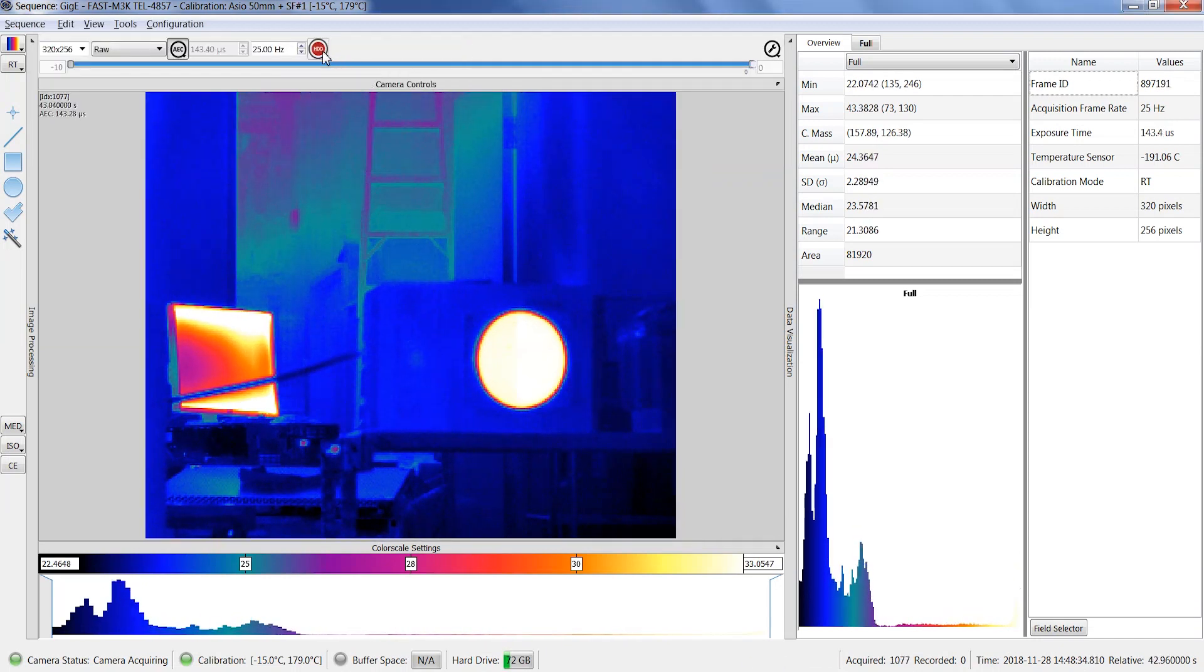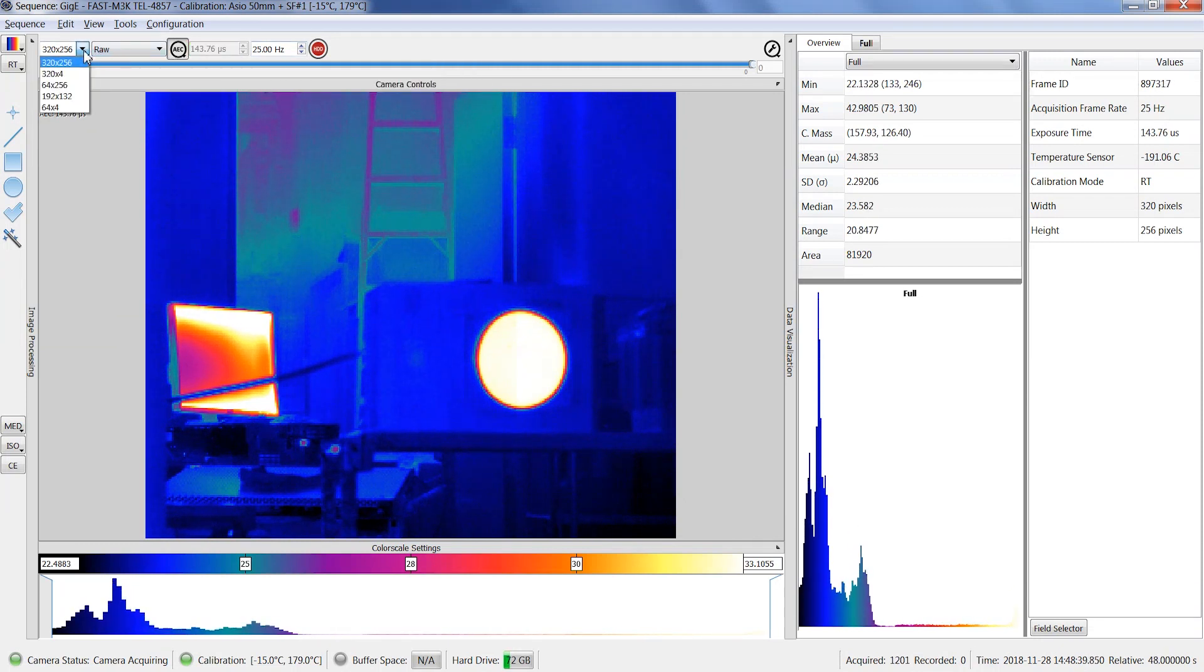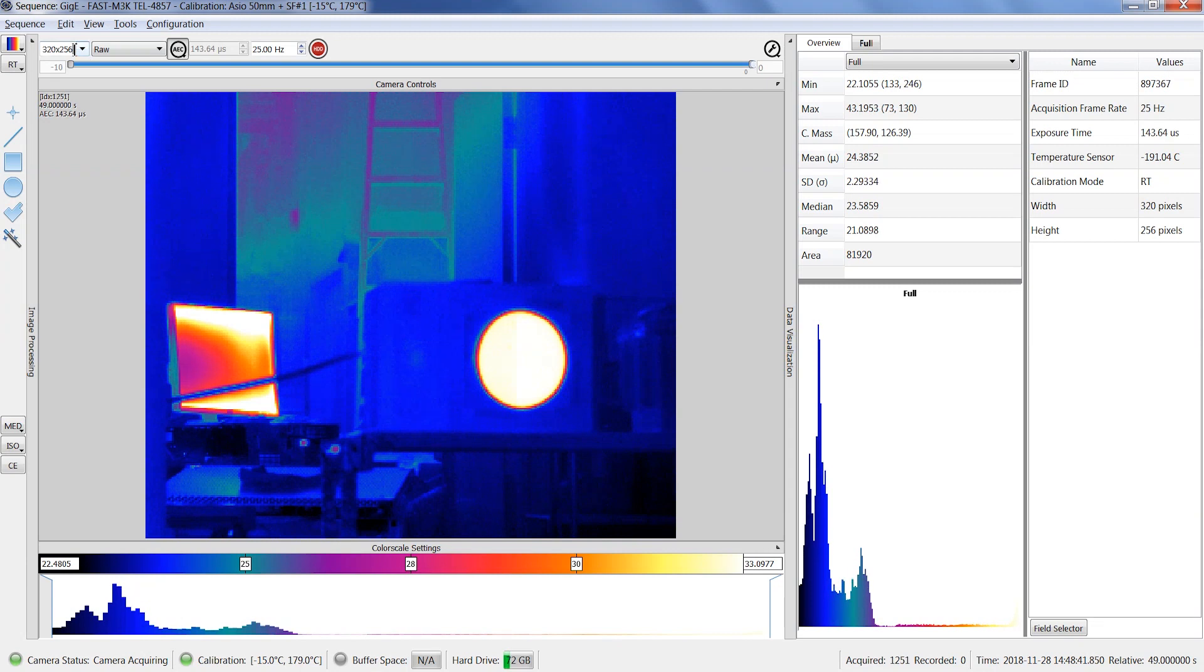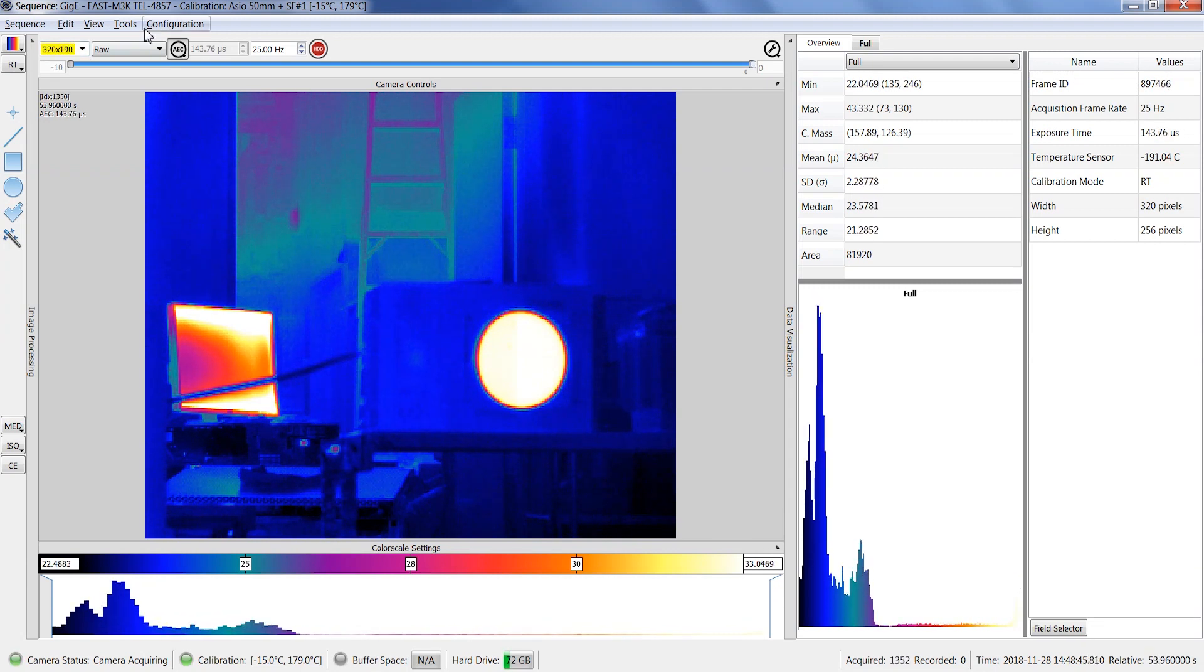First you can adjust the window size by a manual entry in the text box or by using a predetermined value in the list. Invalid values will be shown in yellow to indicate that the camera doesn't support them.